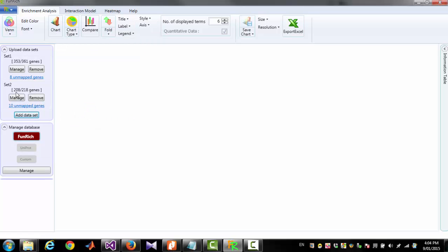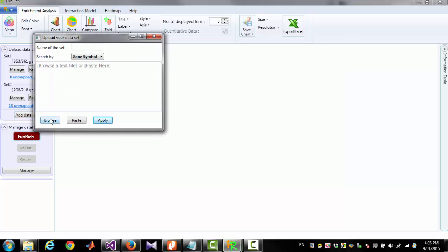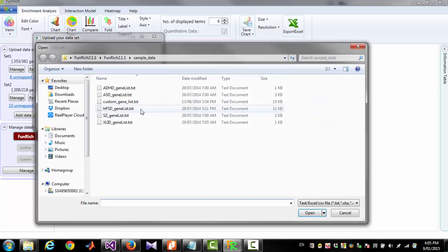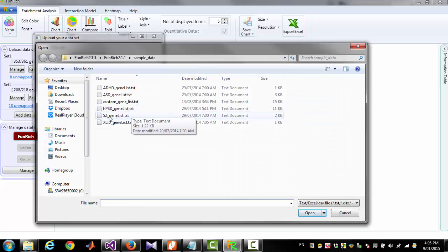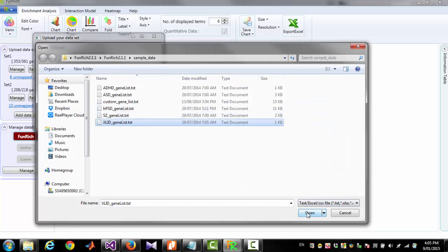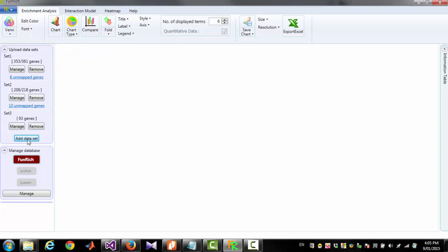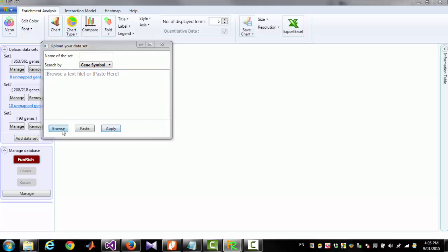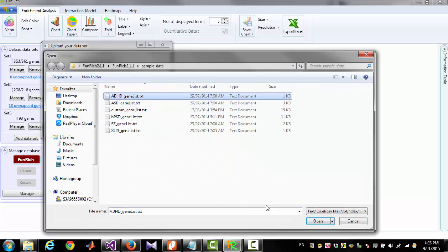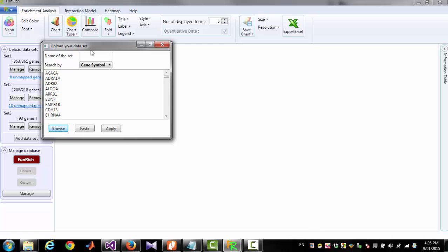You can see that 208 genes are identified from a list of 218 genes. And now I am adding 2 more GeneLists. I am calling this one Set3 and I am adding another set and calling it Set4.